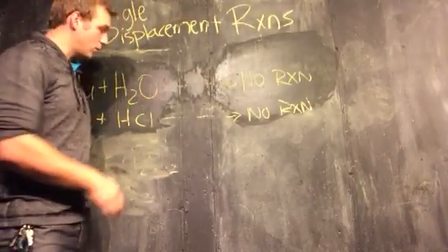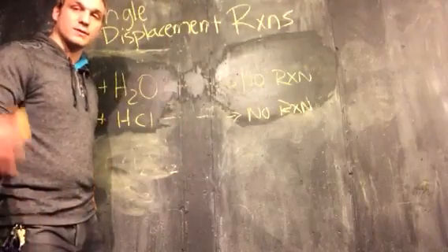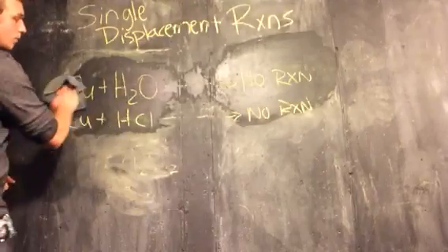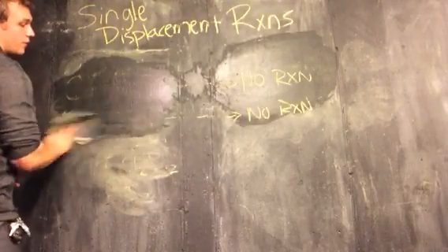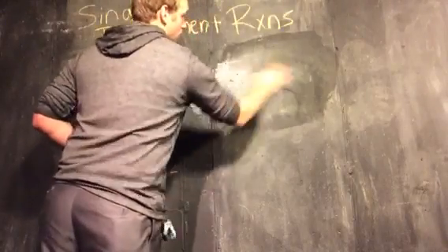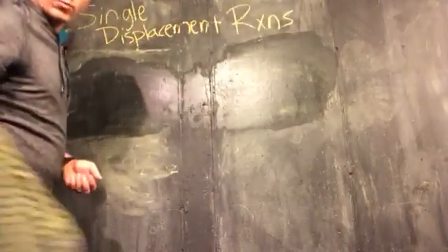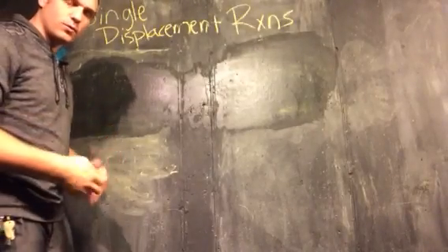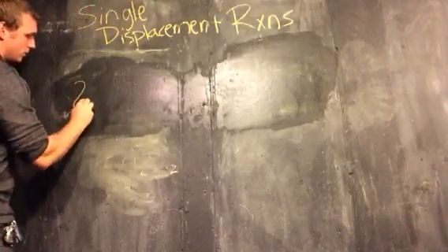Okay? So both of these give you no reaction because the activity series says copper plus water or acid, nothing's going to happen. Let's look at one more before we move on to another way to do single displacement reactions.